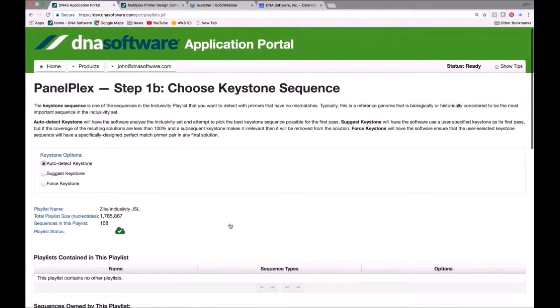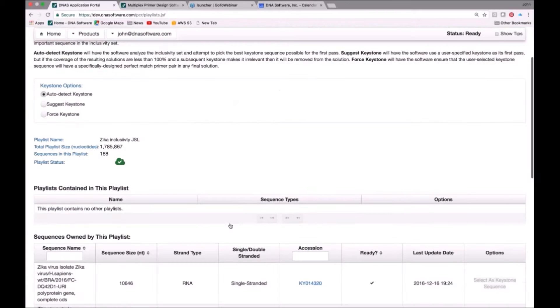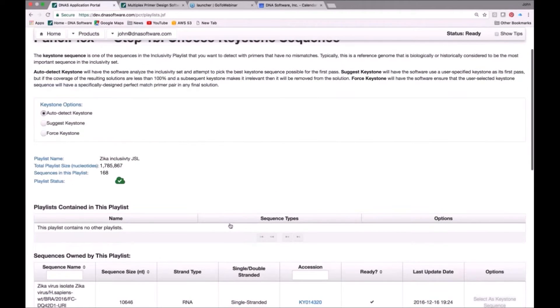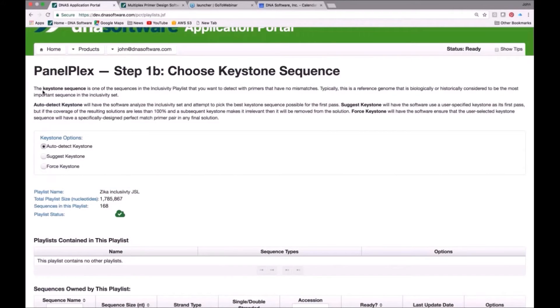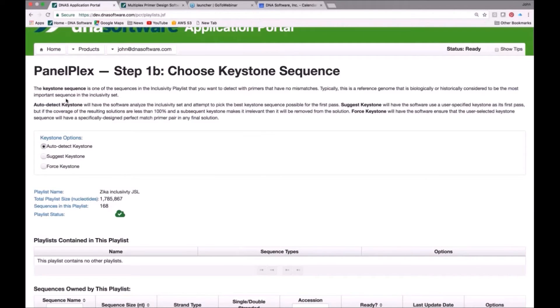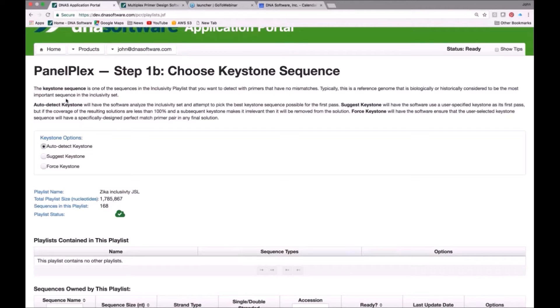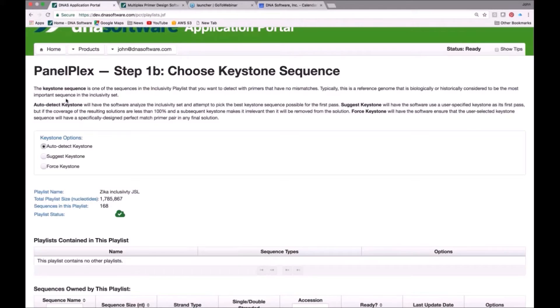Next is this issue of the keystone. I haven't talked to you about what a keystone is, but here it is here. The definition is given right at the top of this page. The keystone sequence is one of the sequences from the inclusivity playlist that you want to detect with primers that have no mismatches. Typically, you would choose a reference genome that is biologically or historically considered to be the most important sequence in your list. Now, we have three different ways that you can choose a keystone sequence, but this is the sequence that is going to be sort of the center of the design, and variants thereof will go around that design.